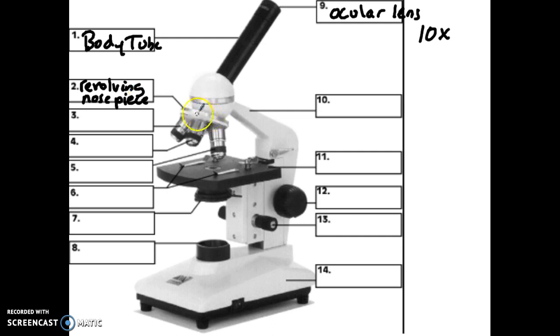The revolving nose piece, what you would do is you would change that manually, and what that will do is it will physically change the objective lenses that are found below. This compound light microscope has three different objective lenses.